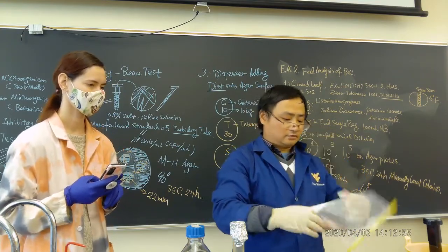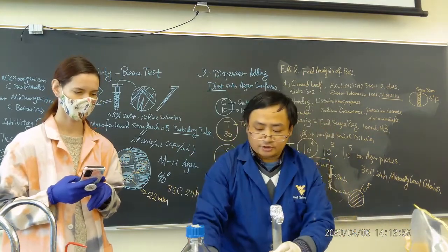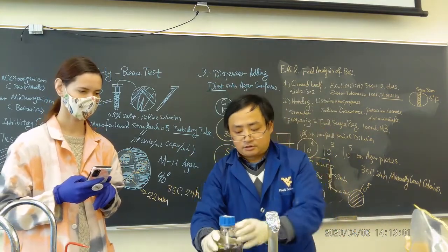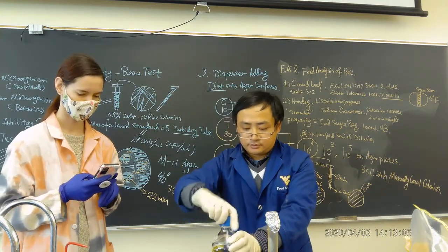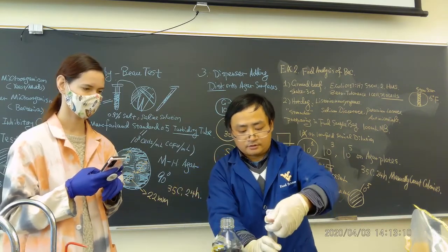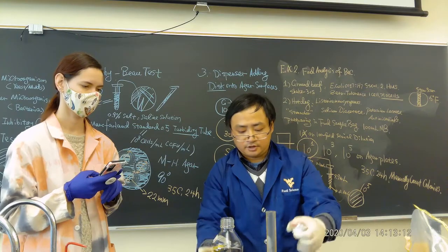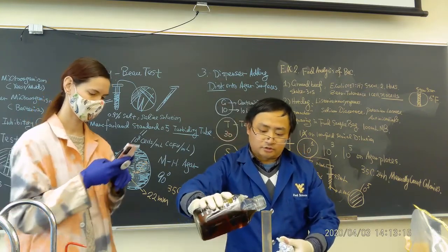Now, you can stay this one on the side. We're going to be adding these sterilized, autoclaved cylinder. We have to dump in here. Let's do maybe a hundred. Let's do a hundred, a hundred ml.